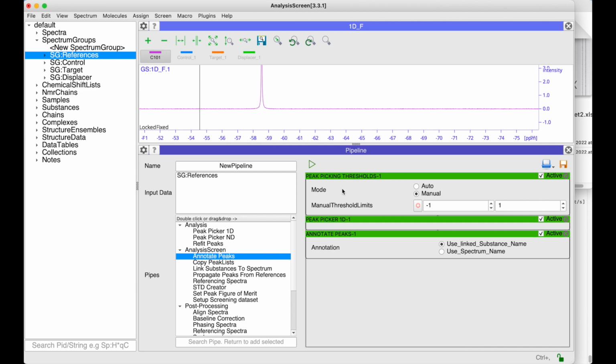Okay, so that's all done. So we can now run this pipeline. So simply click on the play button.